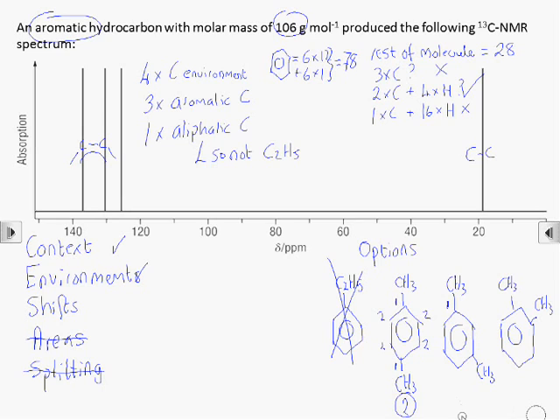So one, and that's identical. There we go. Second carbon, there's nothing the same as that one. Third, they're identical. And the fourth one. Four carbon environments in 1,3-dimethylbenzene. So it's not that one either.